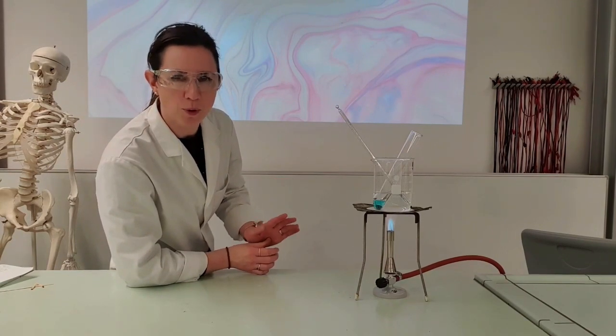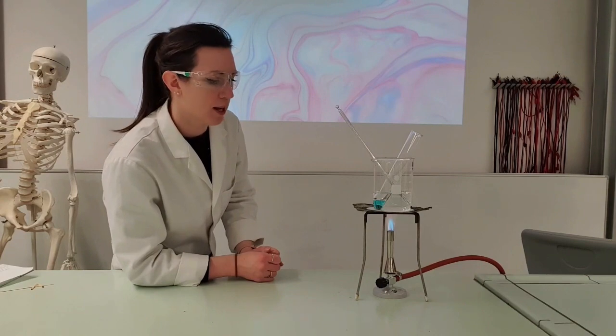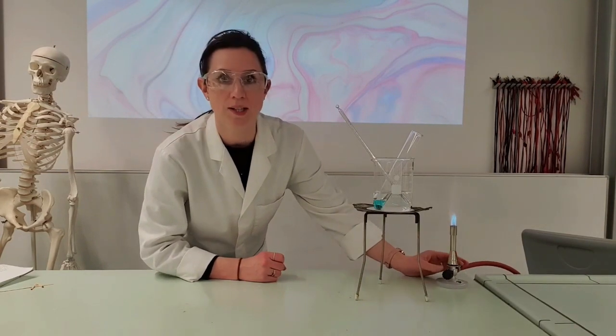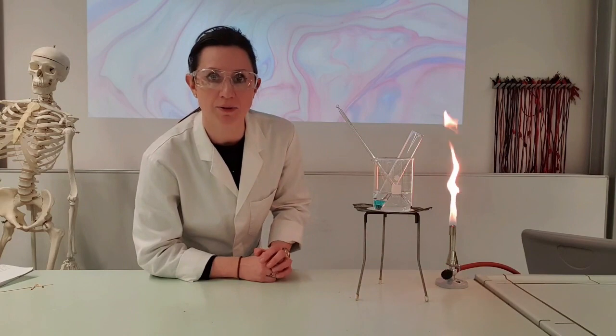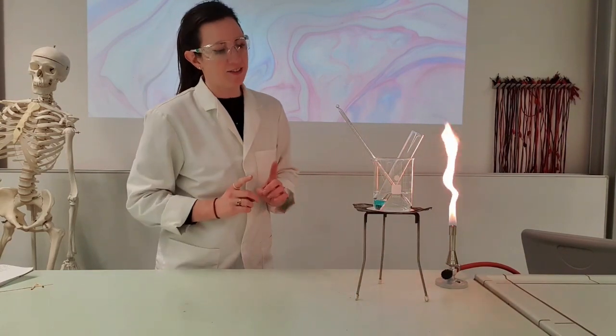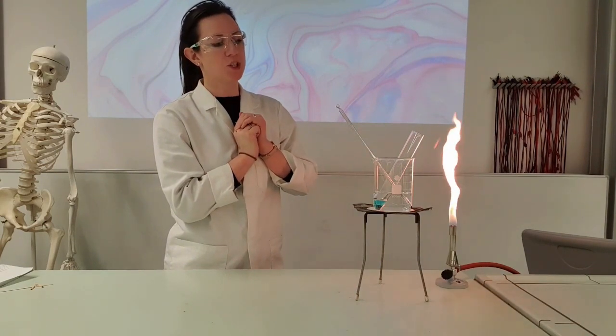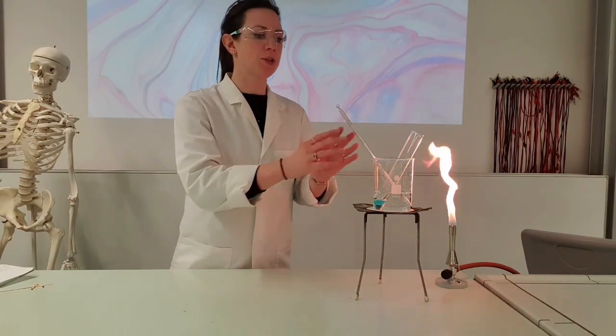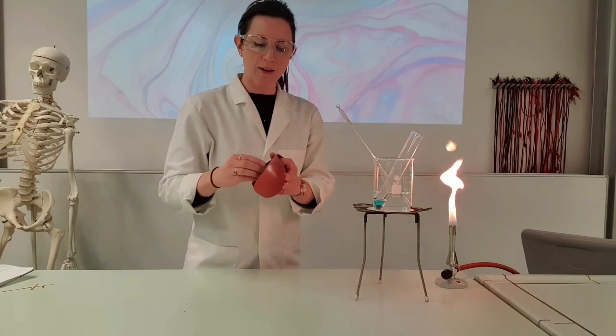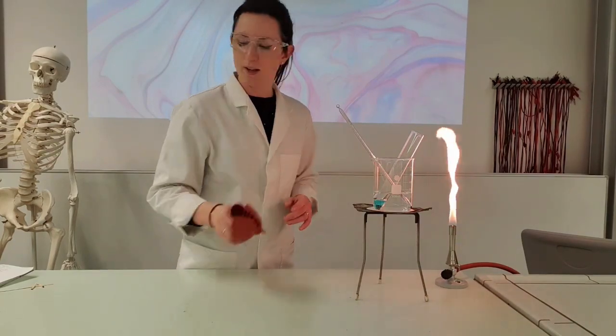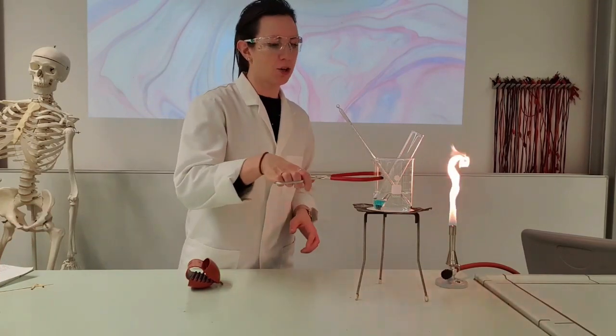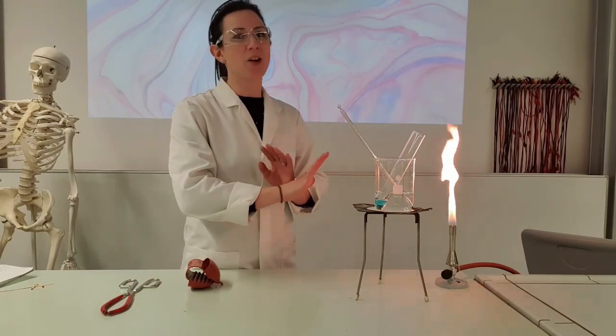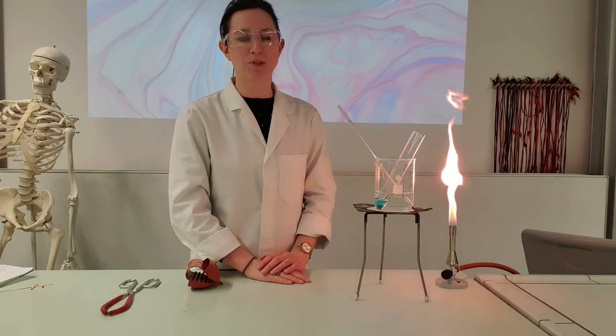Now imagine the experiment is finished and over and done with. We need to dismantle all this hot equipment. So the first thing you do is reverse the exact process with the Bunsen burner: pull it out, put it on a safety flame. We've still got the hot equipment on here which is not quite secure, especially if I pick it up with my hands—I could drop it. There are a number of ways that you can dismantle the glassware. We have got a heatproof glove or you can get beaker tongs, but to be honest, the safest way and my preferred way is just to let the whole lot cool down. It will only take five or ten minutes, and then you can touch it with your fingers.